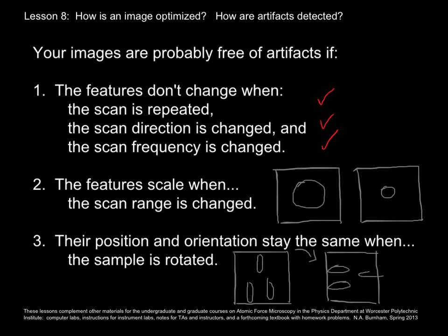And both the relative position of the features should rotate. So this triangle is rotated by 90 degrees. And the orientation of the features should rotate by 90 degrees.